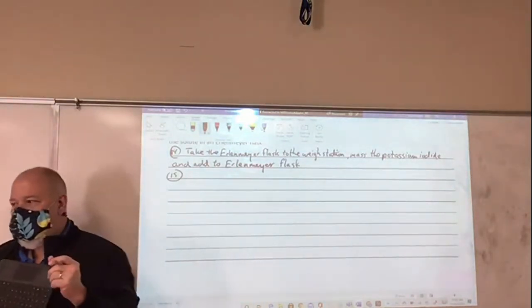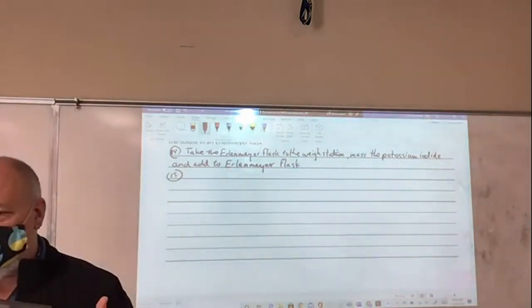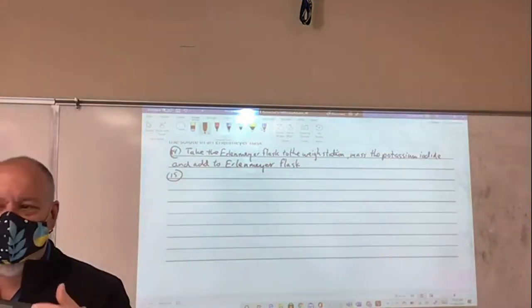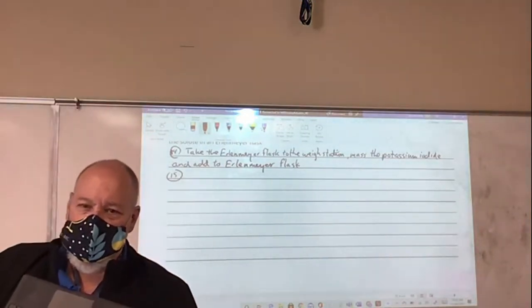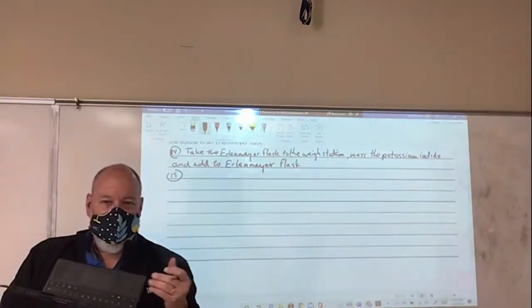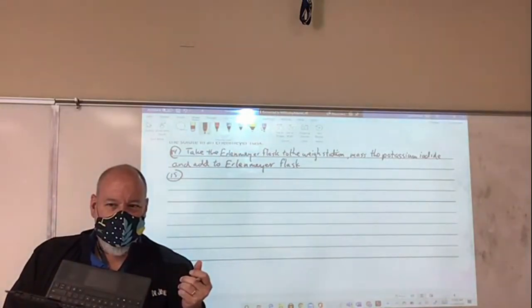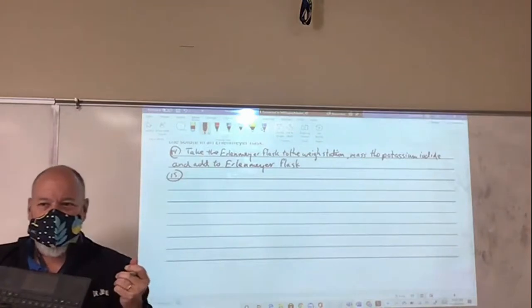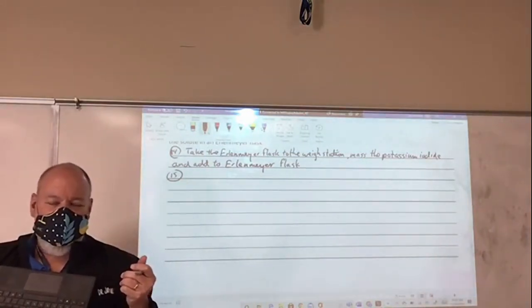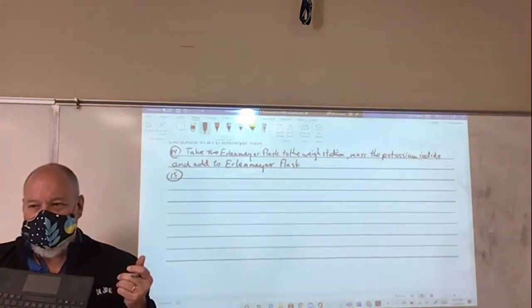I want to get a little bit more detail related to how we actually accomplish this. How do I get the 25 milliliters up into it? I don't just use the pipette bulb. What am I looking for? Okay, Garen. Releasing a suction from the pipette bulb, bring up 25 milliliters of water through the graduated pipette. Okay, let's even go more than that. Aspen? What we could say is attaching it first.